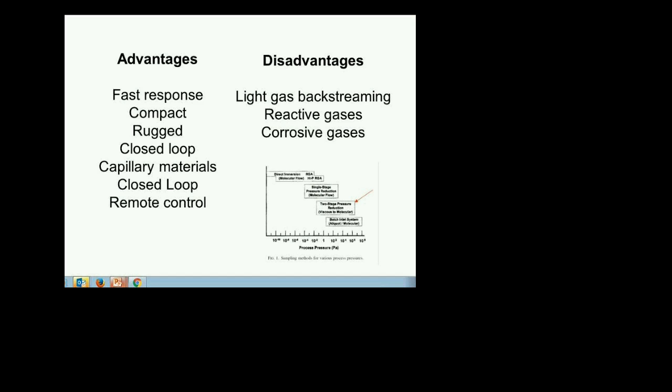But I was wondering, would it be inappropriate to use it with a chamber and purposefully introduce hydrocarbons, oils, to analyze at what level of vacuum they individually would vaporize? Would that immediately contaminate the ionizer and ruin the RGA? Or is there another type of sensor that would be better for something like that?